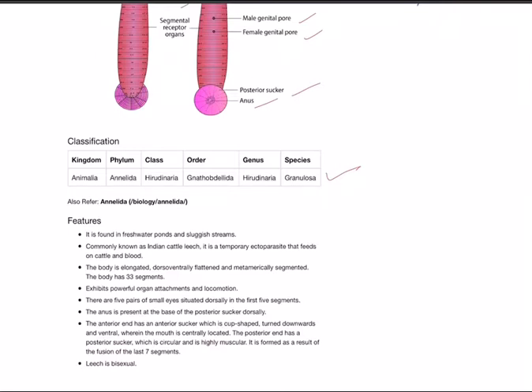Now come to the features. It is found in freshwater ponds and sluggish streams, commonly known as Indian cattle leech. It's a temporary ectoparasite that feeds on cattle blood. The body is elongated, dorsoventrally flattened, and metamerically segmented.